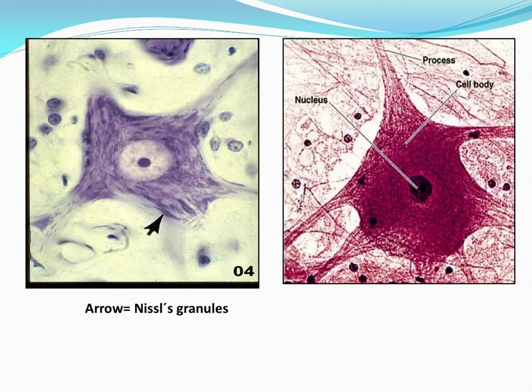The intermediate filament has a diameter of 10 nanometers. But during the fixation process, the fixative causes the coagulation of these intermediate filaments, called neurofilaments, to stick together and form what is called neurofibrils.